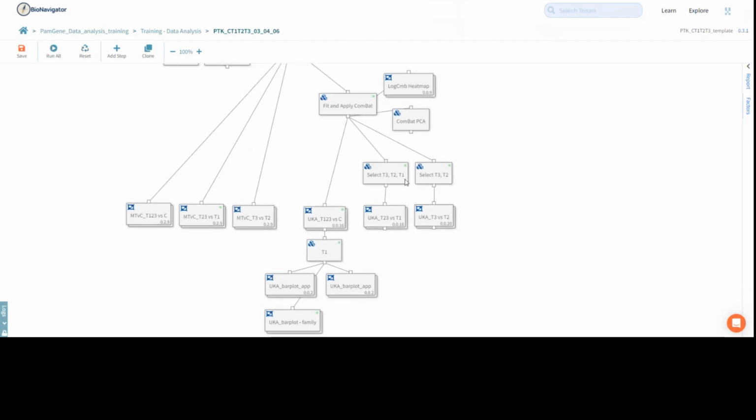For these comparisons, we pre-filter the test conditions. This is not like how we do it in phosphosite analysis, MTvC, because there the ANOVA takes all comparisons into consideration. Therefore, we do not pre-select the conditions, but later filter for the interesting ones. However, the UKA works per comparison, thus pre-selection of interesting conditions is needed.